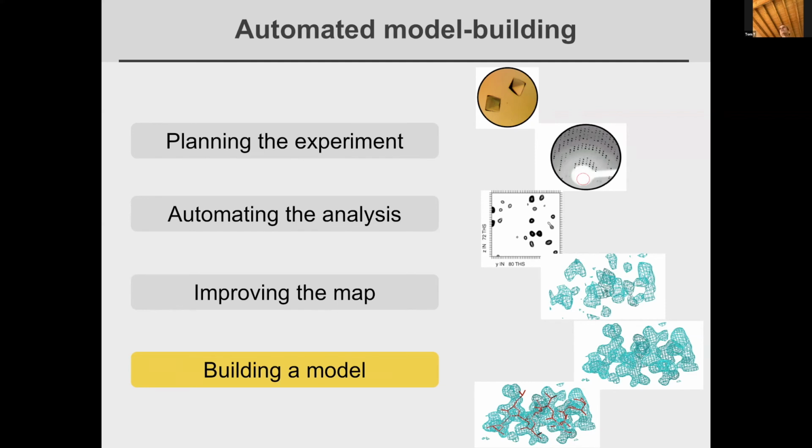You can also treat proteins as ligands. So once you have your main chain built, you could replace parts of that with a dummy version of a protein that has your side chains affixed, and then you could fit it in that way. But we don't have a great tool for the situation you're talking about. We'd have to make something custom. So it's a great point.